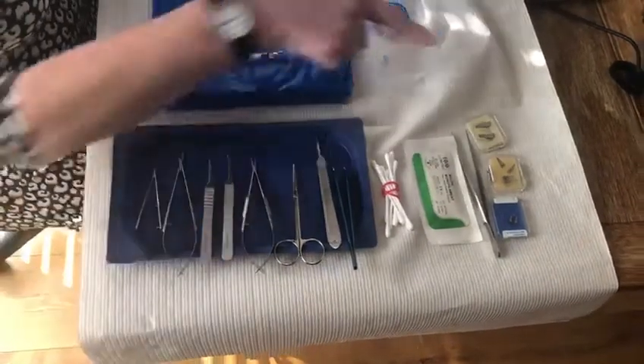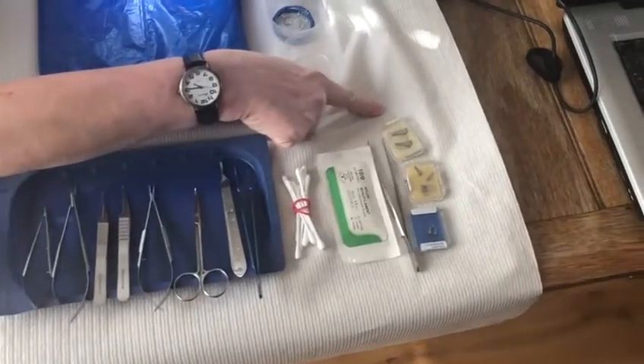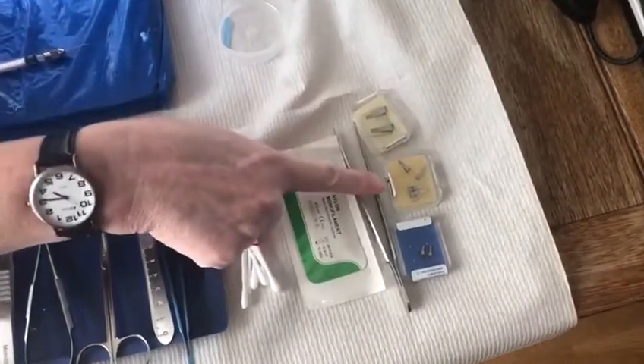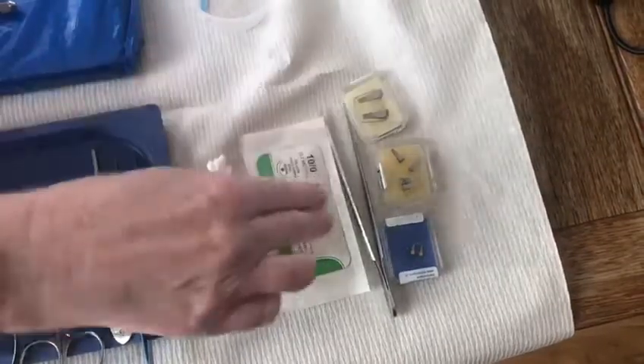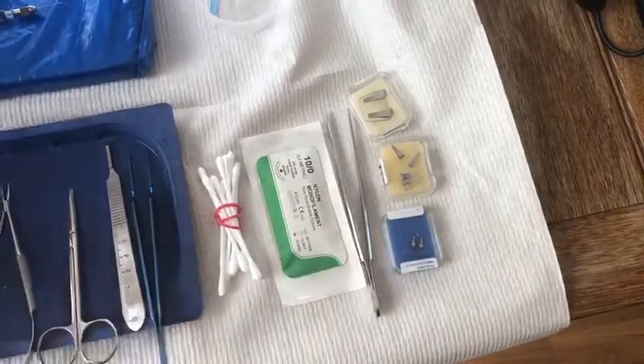Then you will need clamps of various types. I've got some Ackland clamps here ranging from size one up to size three. I prefer to teach using the ones on the frame, but it's entirely up to you which ones you've got available. And then we've got the clamp applier to actually apply those onto the vessel.